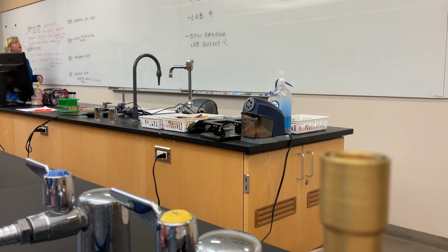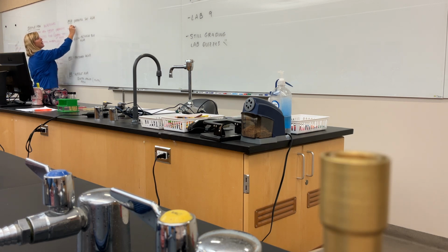Can I just rotate? Okay, so nutrient agar is going to be our control today, but we are going to set up these three types of media, and these media are going to be selective and differential. So we're going to see some pretty cool results next time. I'm just going to put S and D, so I'm writing that.